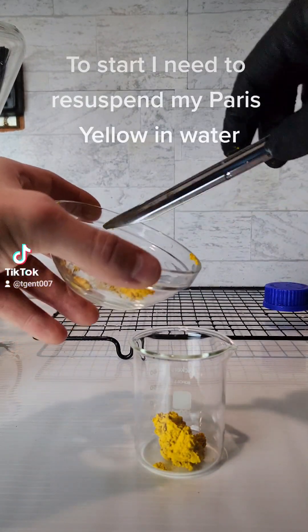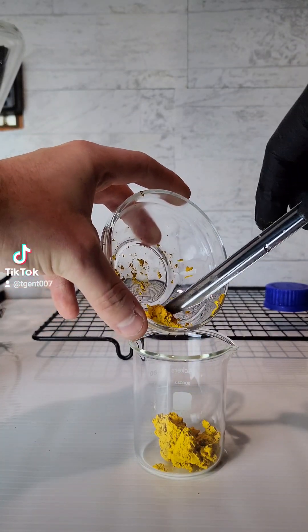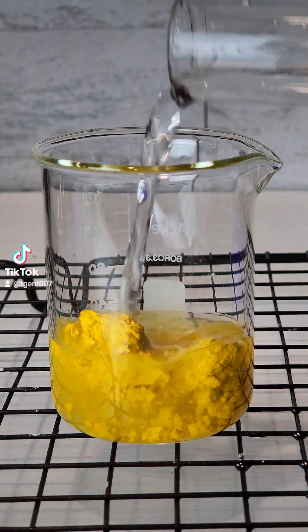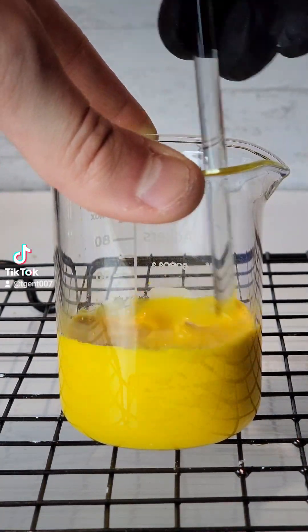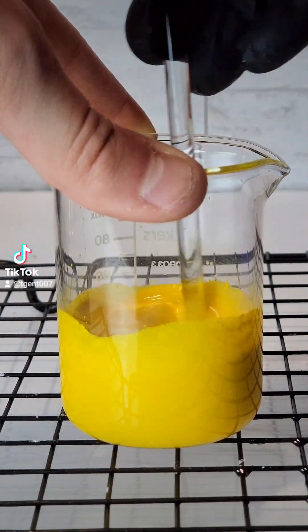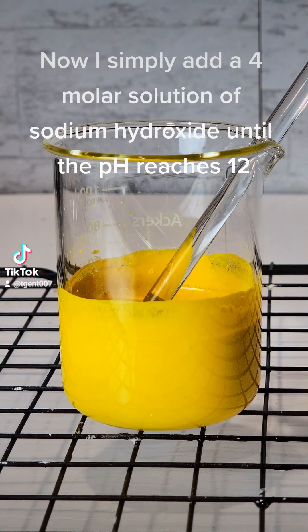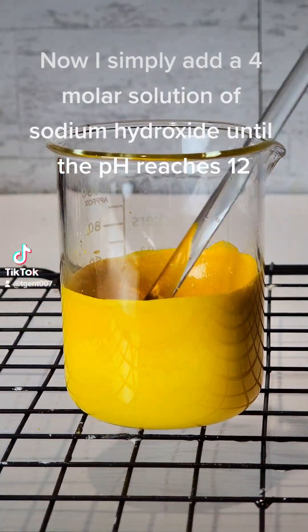To start, I need to resuspend my Paris Yellow in water. I simply add a formolar solution of sodium hydroxide until the pH reaches 12.